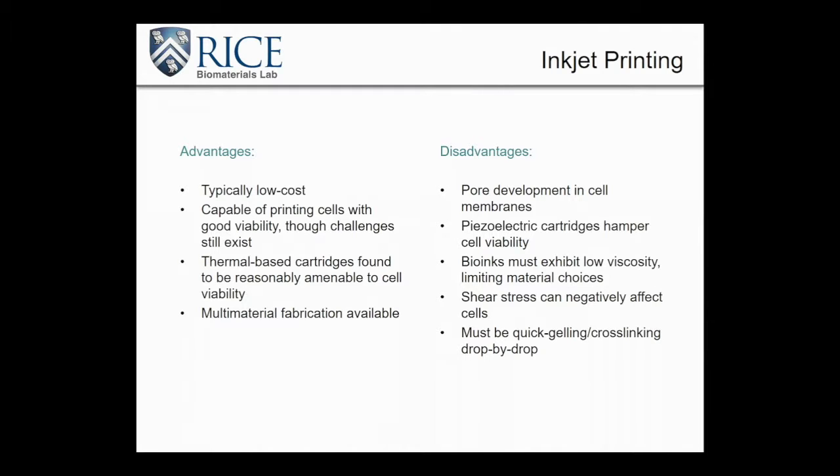But like I said, some of the disadvantages here are the effects that we might have on cell viability, especially in the case of piezoelectric cartridges. There's also been a noted phenomenon of pore development in cells that are 3D printing because of the shear stress effects on these cells. However, there's also research that utilizes these pore developments in these bioinks by incorporating things like genetic engineering or drug delivery, so you have a perfect time for cells to encourage uptake of these factors during that printing process. So that disadvantage can actually be turned to an advantage, and you will see some research that uses that.